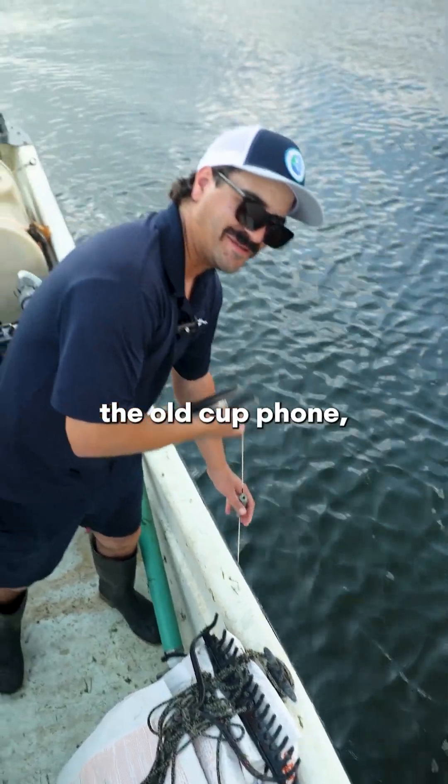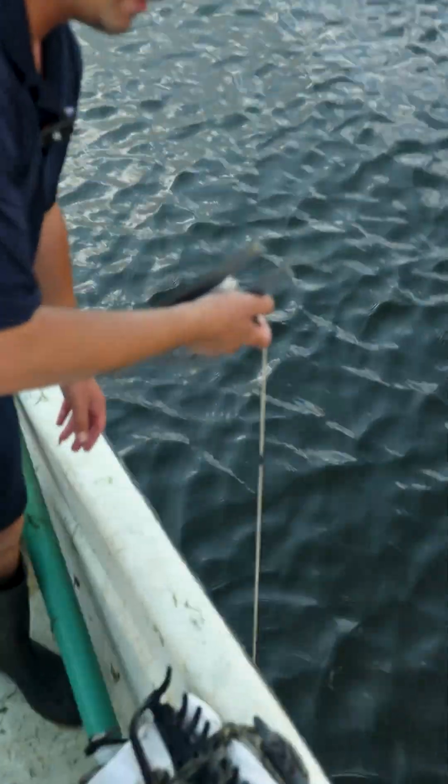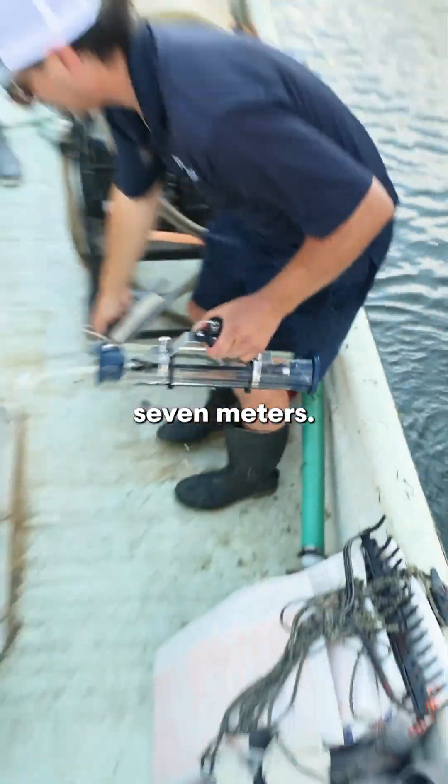You can feel it through the string — like the old cup-and-string phone — but you'll hear it close too. It's loud. It always gets me. And there's our water sample from seven meters.